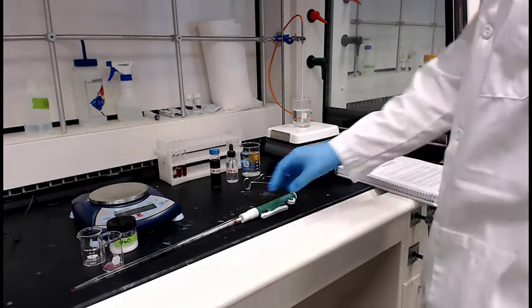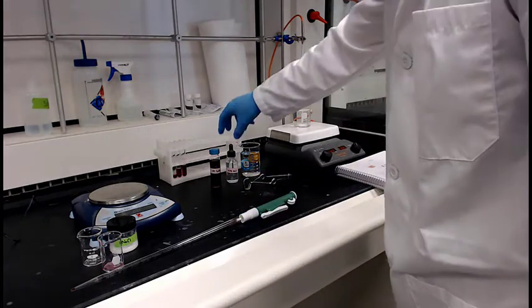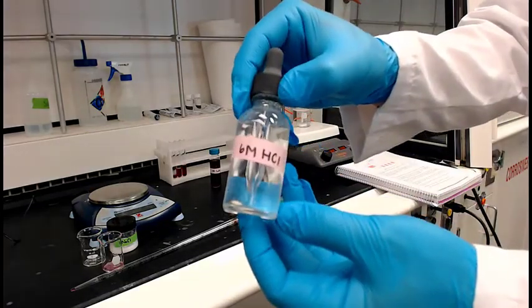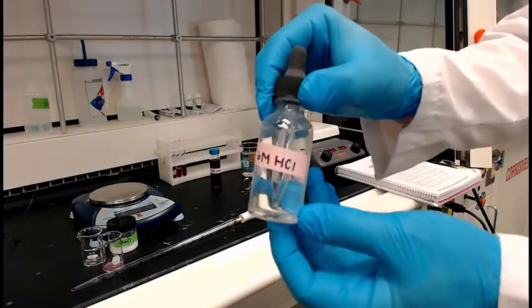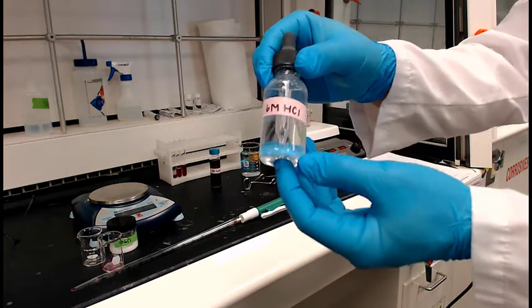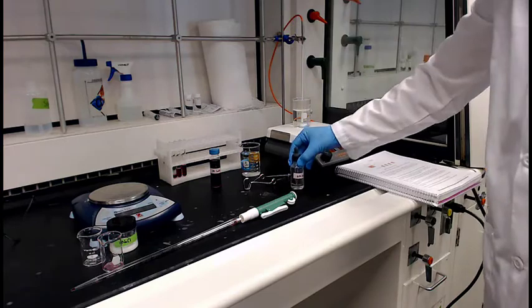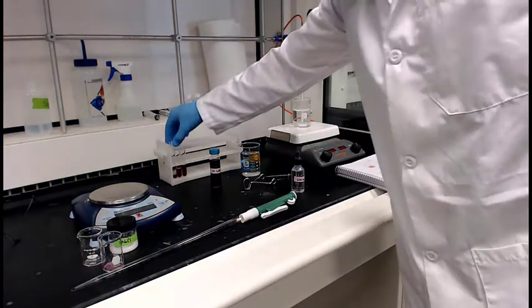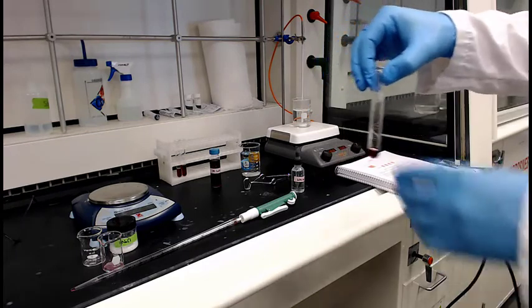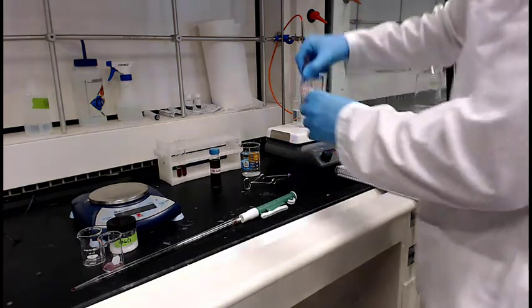So the reason we have gloves, the reason we're in the hood, is we're actually going to use concentrated hydrochloric acid. And that's actually supposed to go into tube 1.